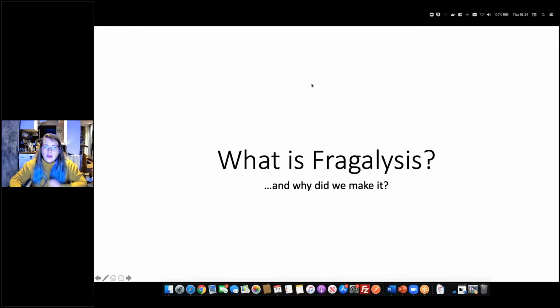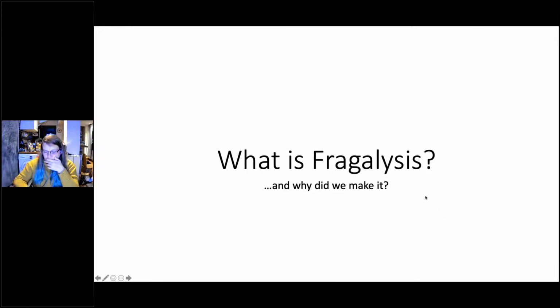So now that I've gone over time, one quick question? Yeah, of course, absolutely. Looking at the things that you've just described, one of the questions is, do we need to predefine the interaction sites manually? I presume that means the active site, or is it generated automatically?